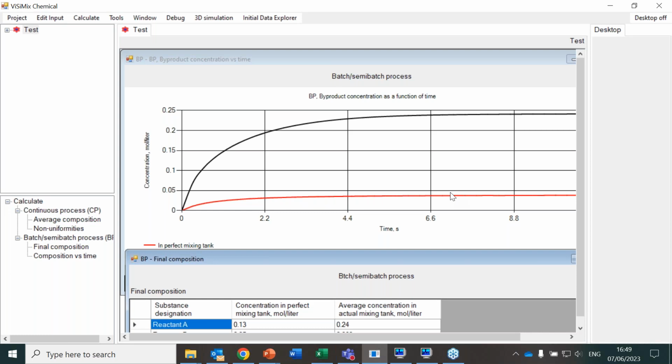How much material will I get, what will be the deviation, what will be the order of magnitude of the deviation, even if we do not have exactly the reaction rate, but we are able to provide it in a good way. Of course, this is a demo.